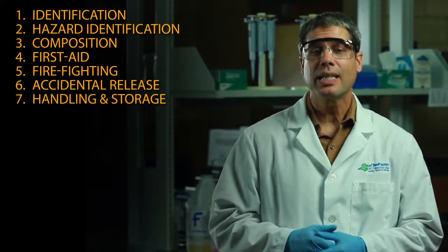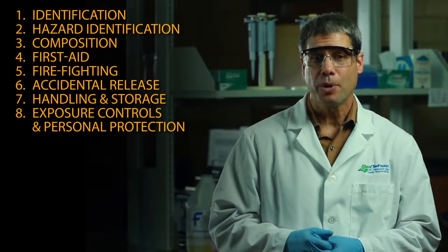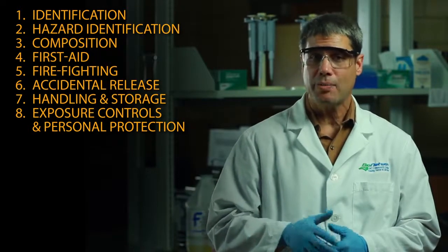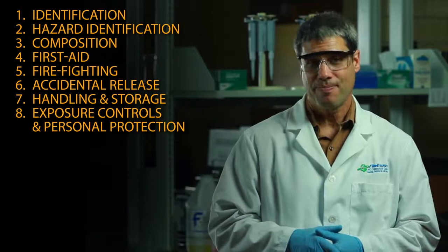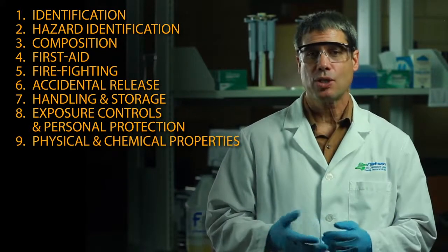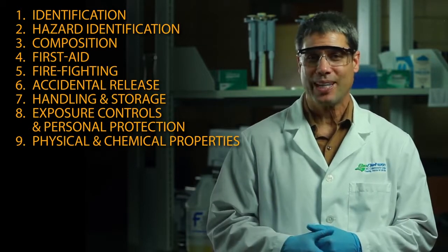Section 7, Handling and storage requirements. Section 8, Exposure controls and personal protection. This describes OSHA's exposure limits and recommendations for PPE. Section 9, Physical and chemical properties, such as appearance, odor, pH, flash point, solubility, and evaporation rate.